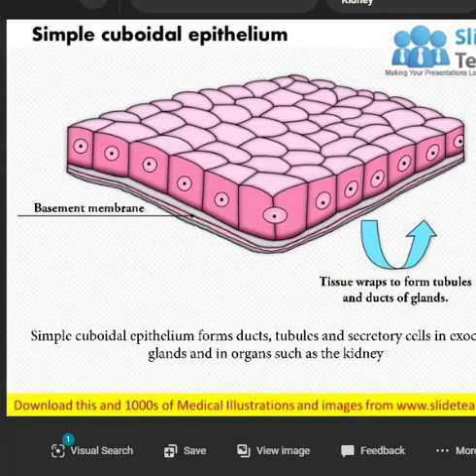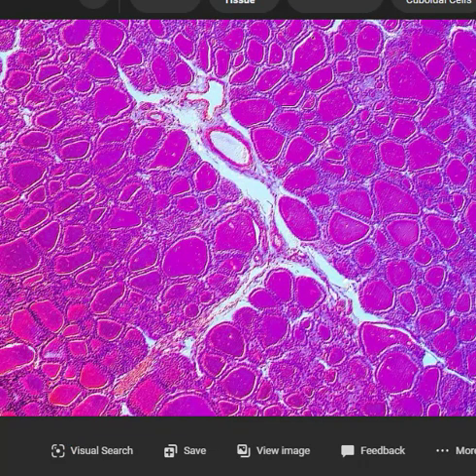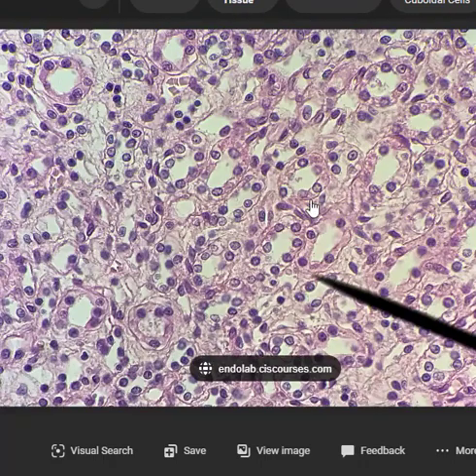A second type of epithelial cells are the cuboidals. So they are exactly what they say. They're cube-shaped, like dice or cubes of cheese. They're generally forming ducts, tubules, and they're secreting things. So usually when you see things like this, they're going to be squirting something out. Sometimes cuboidal cells look like little rocks or little pebbles, but usually you find them in rings.